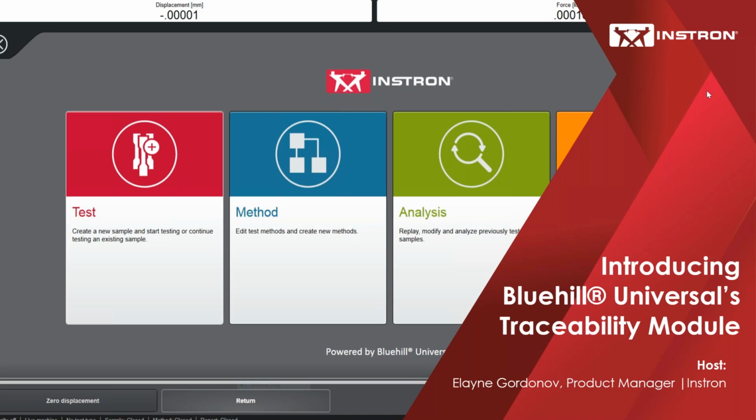So as Nick mentioned, my name is Elayne Gordonov, and I'm the product manager for Instron static software. So that's Bluehill Universal and Trend Tracker. And in today's webinar, I'll be covering Bluehill's brand new module, the traceability module.